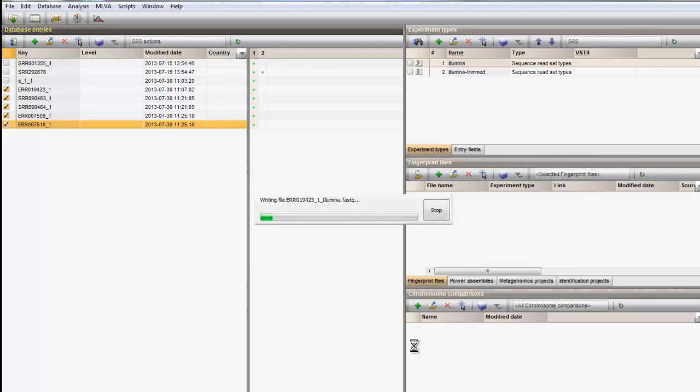From these preprocessed datasets, different analyses can be started. The dataset that was used to illustrate the trimming feature can now be used for a genome mapping experiment or a de novo assembly, which is illustrated in our other videos.